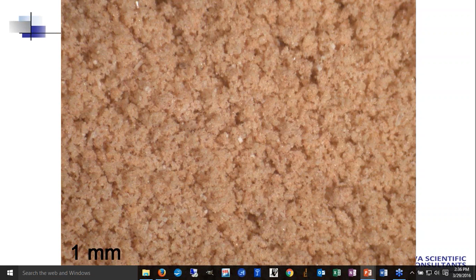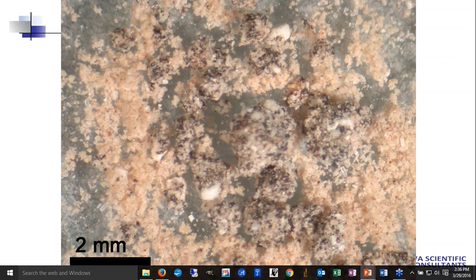Sending the bulk protein powder out for analysis for steroids was testing negative, and that's because the individual particles, shown here as dark particles with white centers, that actually represented the steroid compound were not that common in the bulk of the protein powder.